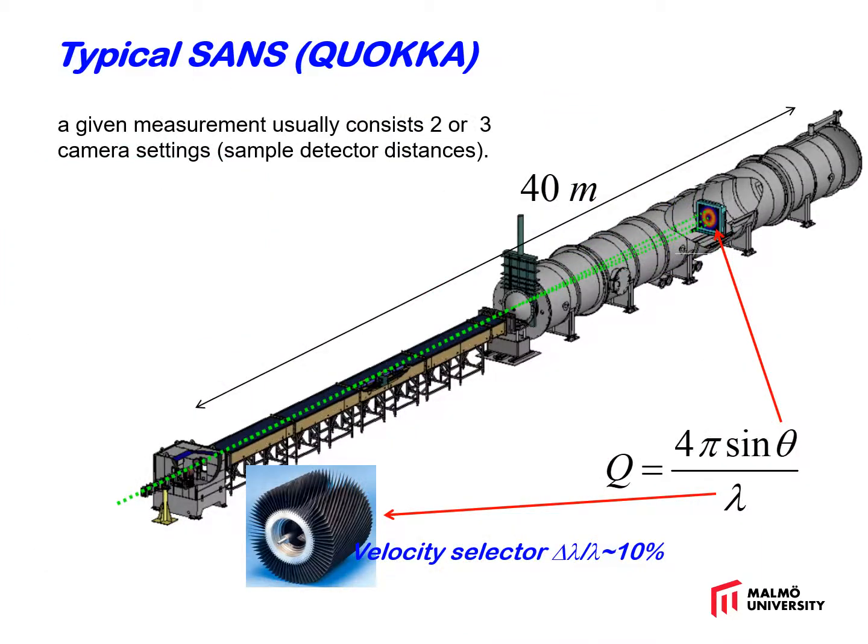So what I show here is a very typical SANS camera, and you can probably put it into the context of the very simple diagrams that I've shown in previous slides. The green line is the neutron path. Towards us, there's a nuclear reactor there somewhere with a cold source. And immediately before it goes into the collimation section, we cut out a band of wavelengths of neutrons.